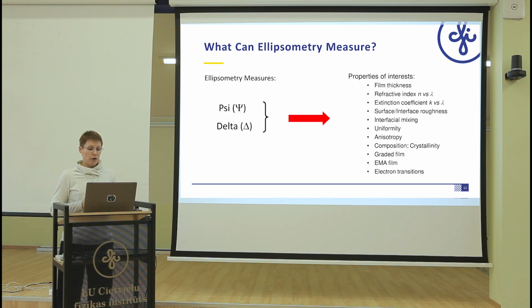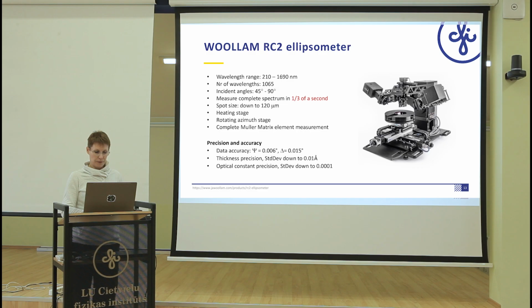We can also do effective medium approximation films. These are films made of a mixture of different compositions. And we can also do electronic transition analysis.